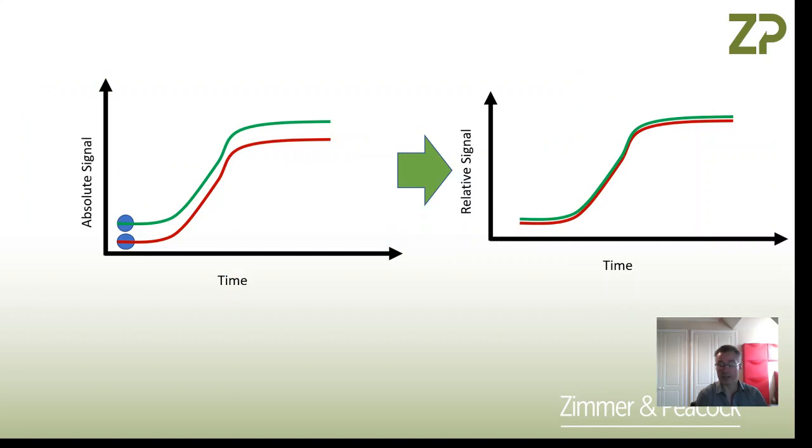And then finally, there's a specific case that comes up quite a bit, where people want to do continuous monitoring of an analyte of interest, and two sensors might give them slightly different absolute signals. You can either fix that by doing a 1-point or 2-point calibration, or you could show relative signal, where you show relative changes by using some initial data points as your baseline, and then show everything relative to that baseline after that.